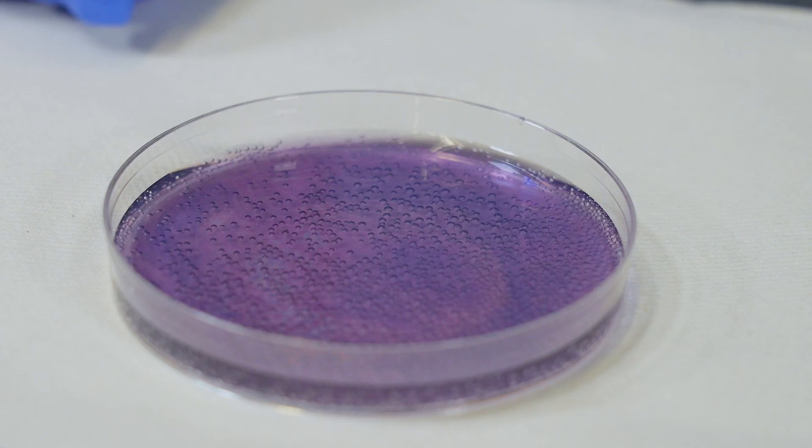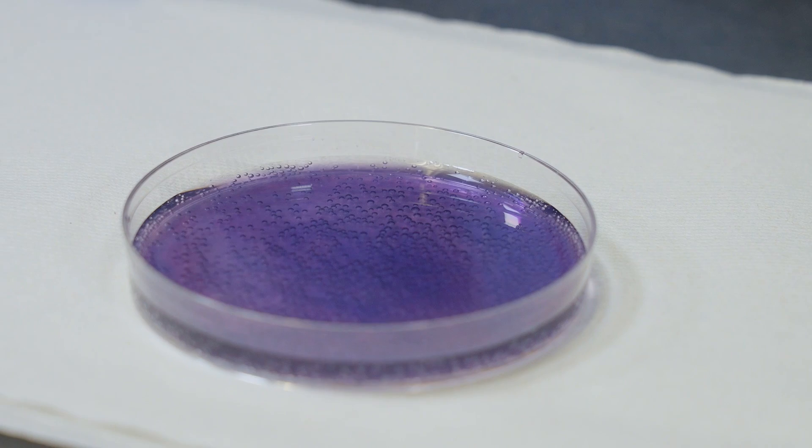And the oscillation is the formation of iodine, I2, reacting with the starch to form a purple color. And then that iodine is actually re-reacting to form a colorless iodide ion.